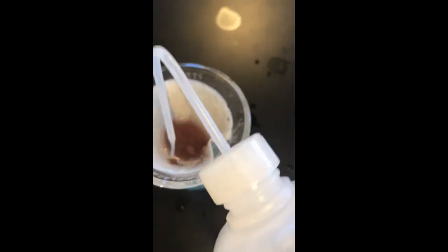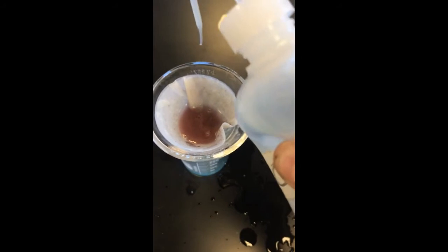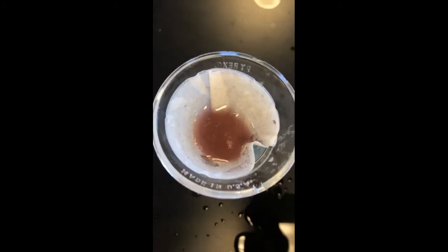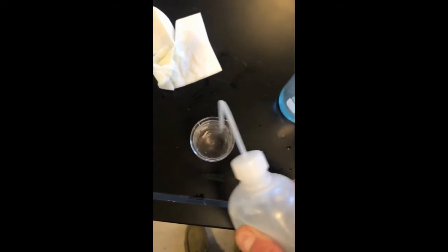Because ultimately I'm going to take this filter paper, dry it out, and then mass it out. So I'm going to go through a series of washings, repeating over and over. I did that for this too.